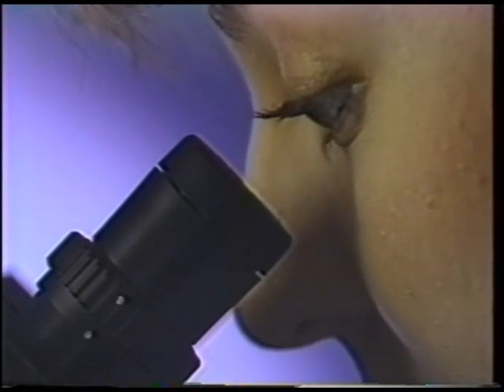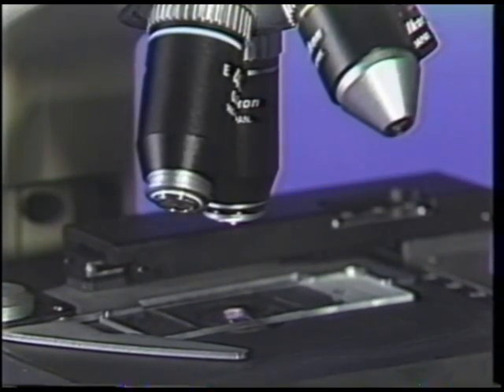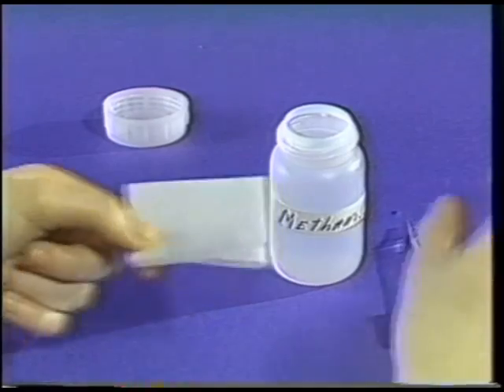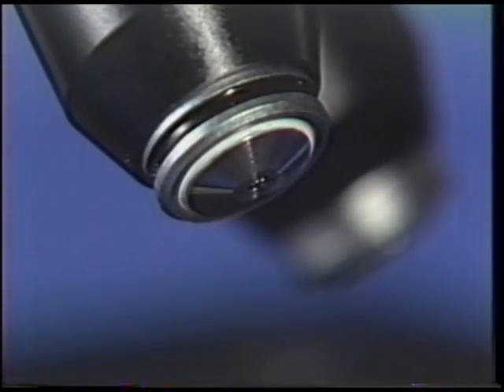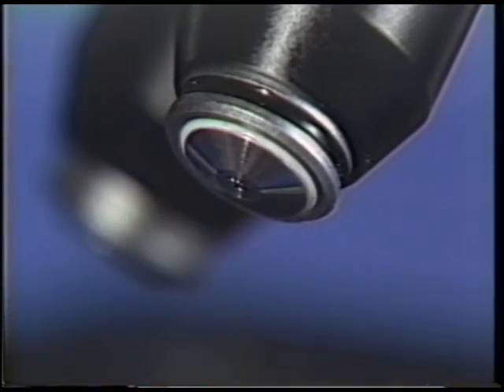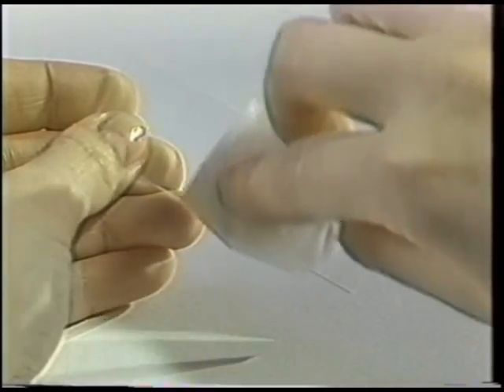Once you have viewed your specimen under oil, it is necessary to completely clean all oil off the objective. Use the coarse focus knob to lower the stage. Rotate the objective to the front of the microscope and remove the excess oil by blotting the lens with soft, clean lens paper. With a new piece of lens tissue dampened with one to three drops of methanol, clean the objective by starting at the center of the lens and moving in circular motions toward the outside. Dispose of the lens paper after use. Repeat this procedure until all oil is removed. To finish cleaning, blot the lens dry with a new piece of lens tissue. Never rub the lens, as any foreign particles that may be present will scratch the surface. Finally, clean your specimen slide with lens tissue or other available laboratory tissue.